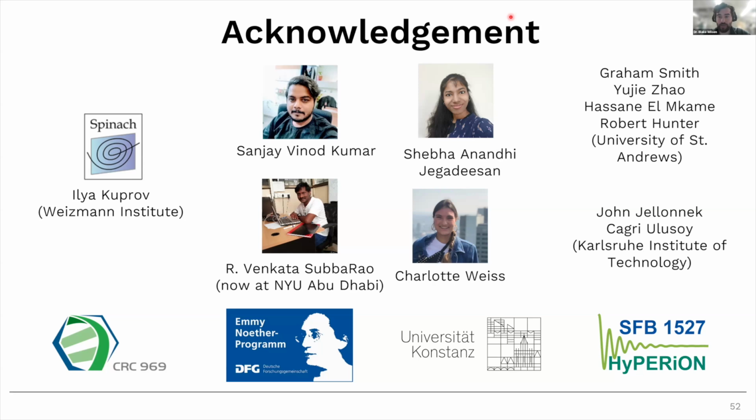What are the things that you have to consider when you're selecting a polarizing agent for a pulse DNP experiment? And are those different than what you might have to consider otherwise? I imagine they are, but if you could talk about what the things you need to consider are. Well, we chose trityl because it was known that it also works nicely for the solid effect. It has a fairly narrow line, so this makes it easier to describe, because we can just treat it essentially as another nucleus, and we could copy the theory.